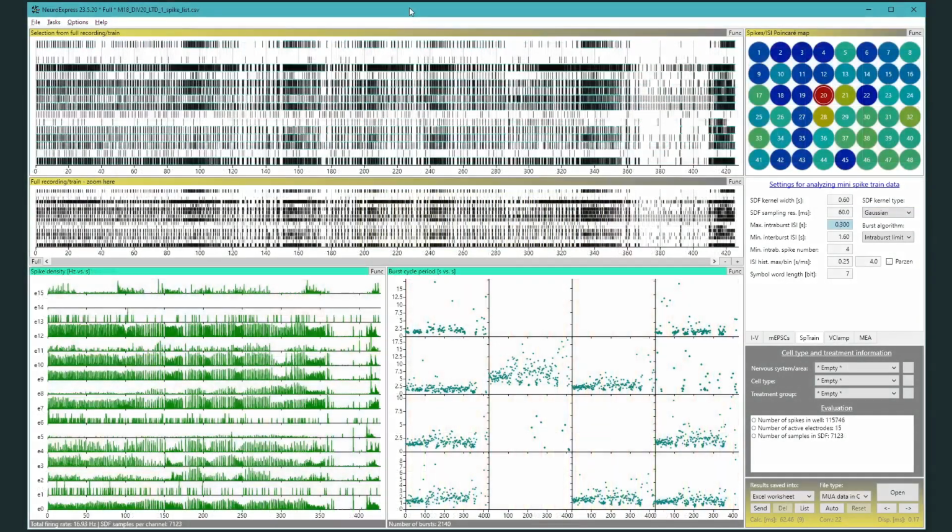Now we arrive at the analysis of multi-channel recordings. These spike time data were collected from a 48-well MEA plate where each well contained 16 electrodes to record neuronal action potentials. Obviously, tens or hundreds of thousands of spikes can be recorded in cultures displaying strong network activity. This is a fine example of that.